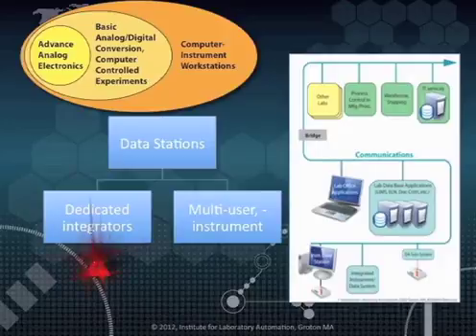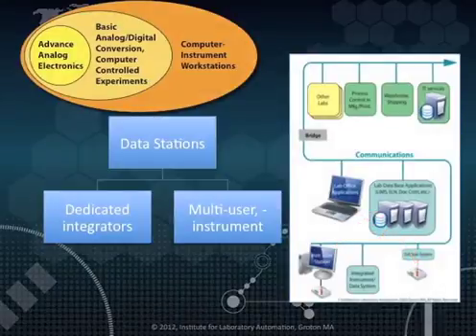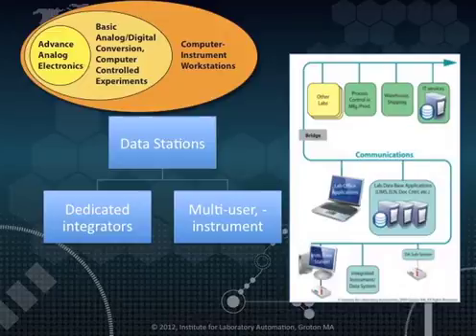The initial products that came to market were simple devices to do measurements from a single instrument and then report them to the user. As computer systems became more sophisticated, so did the software. Vendors developed computer systems that had the ability to attach several similar instruments to one computer, acquire data from each of them, analyze the data streams independently, and produce reports for the user. These evolved into full client-server systems that allowed not only data acquisition from a number of instruments, but also allowed several users to access the data and work with it in the laboratory or from remote locations.